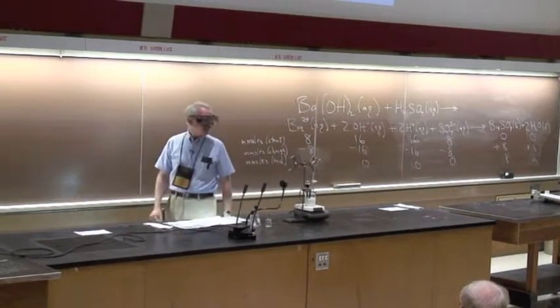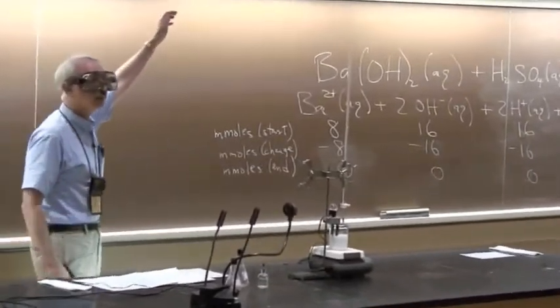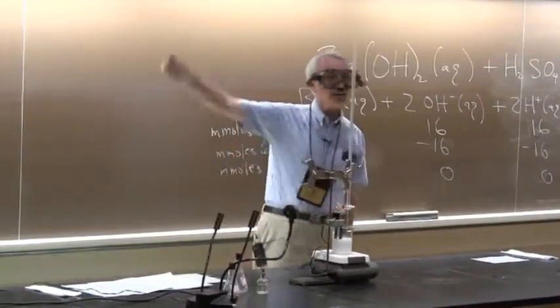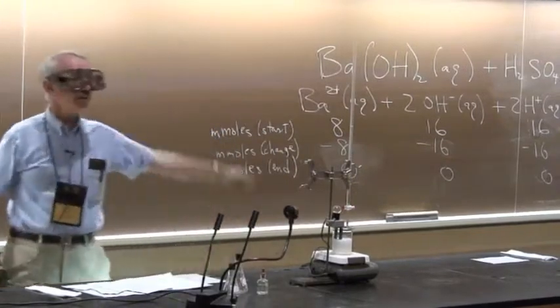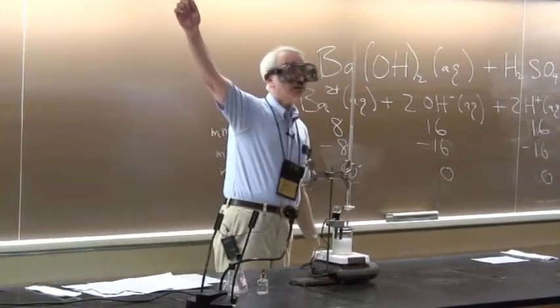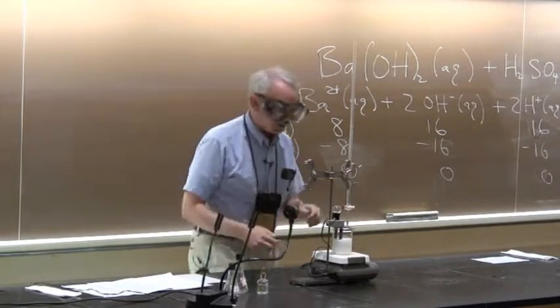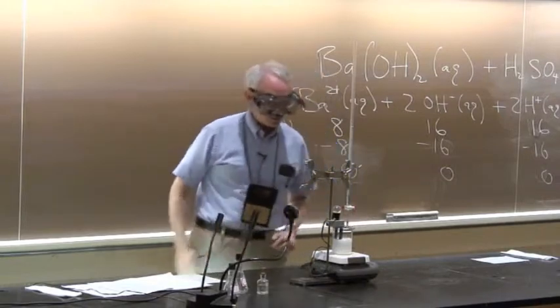How many think the light will go back on? And how many think it won't? And how many think the phenolphthalein will turn pink again? And how many think it won't? And how many think the precipitate will redissolve? I've never had anyone vote for that. Okay. There's always a first. And let's see what happens.